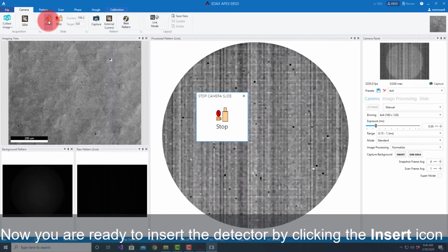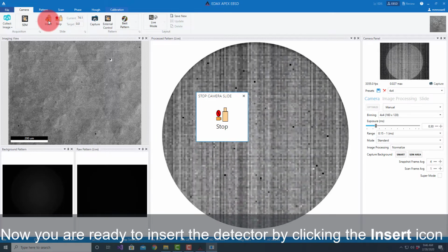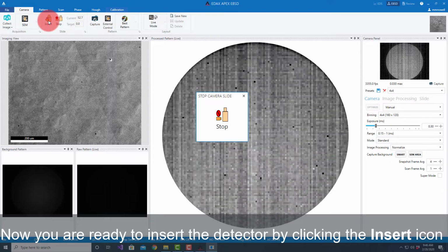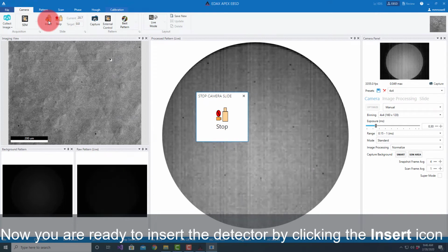You can hear the slide start moving in. The target position is fully inserted, which is 0. We see the current position as we go. I often watch this on the infrared camera just to see that it's moving correctly. But of course, the limit switches and the range have been set up during the installation process.